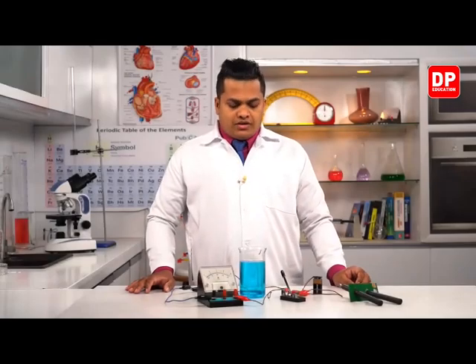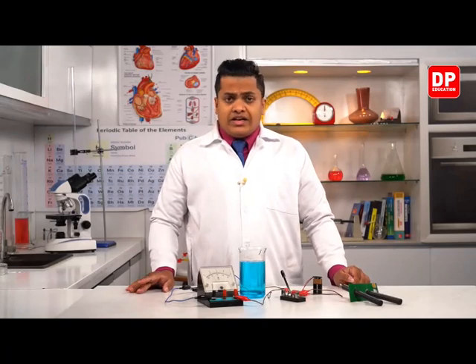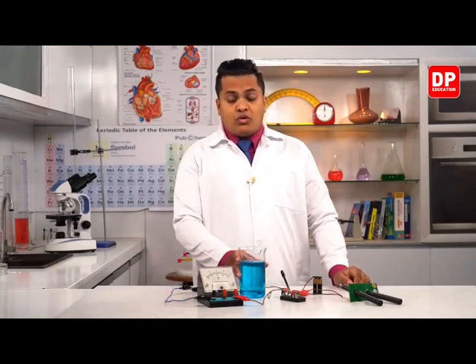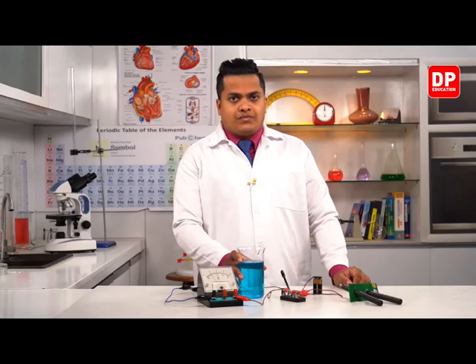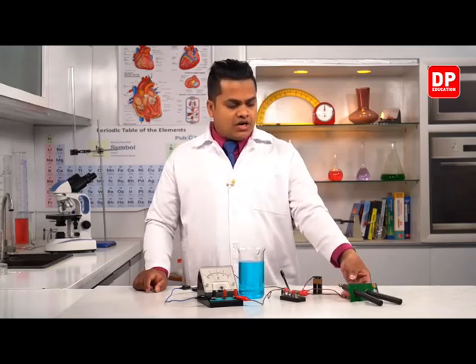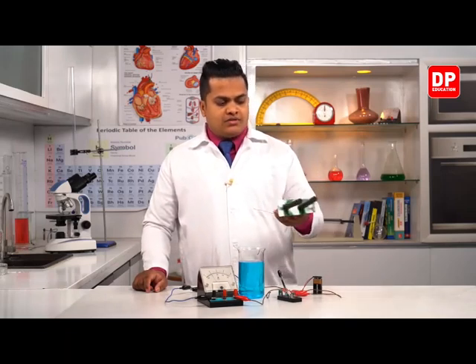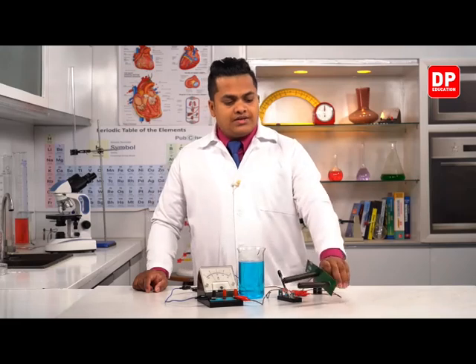So my dear children, within this activity, we'll be electrolyzing this copper sulfate solution. For this electrolysis process, I'm going to use 2 carbon rods like this. These are carbon rods.